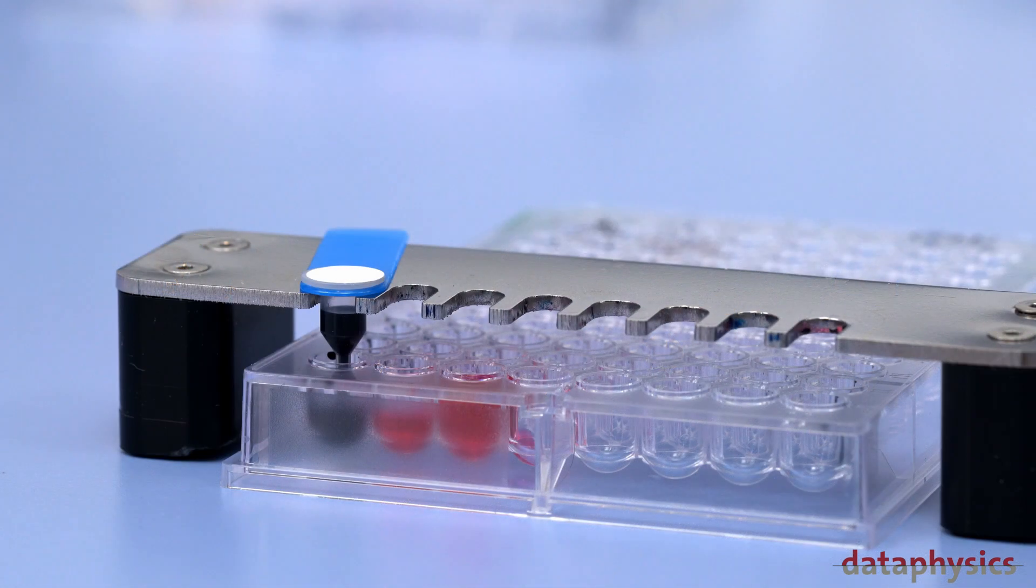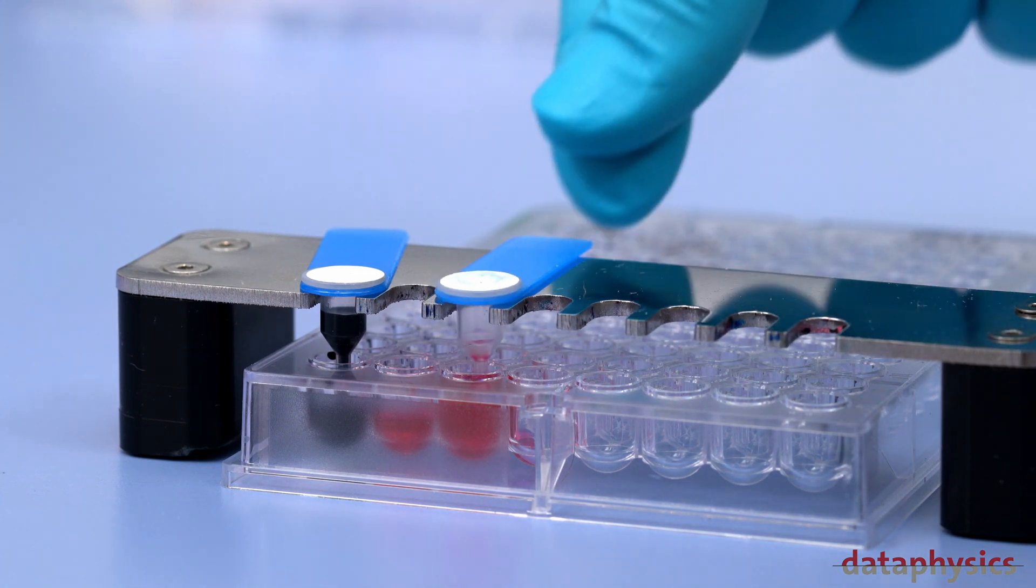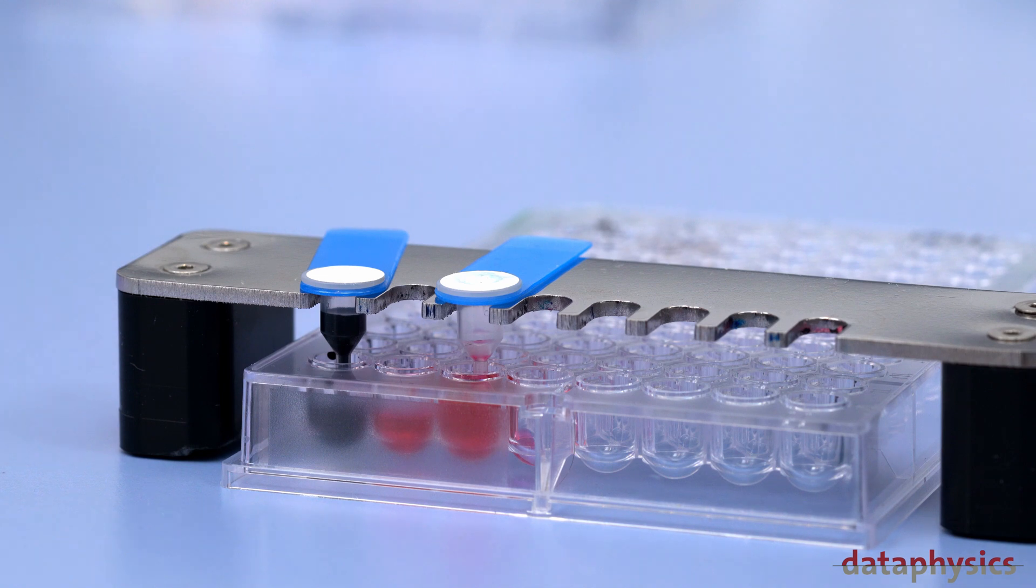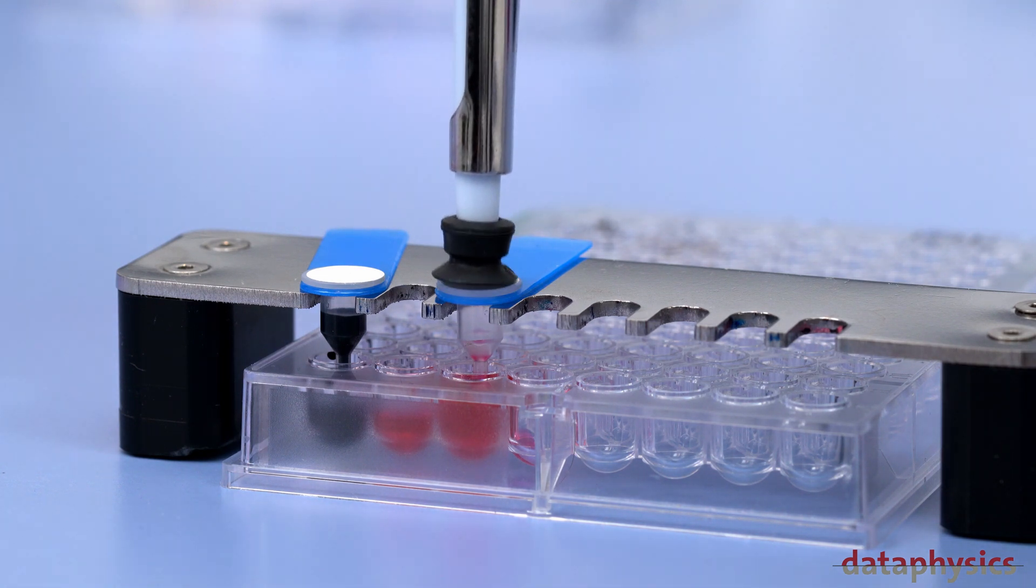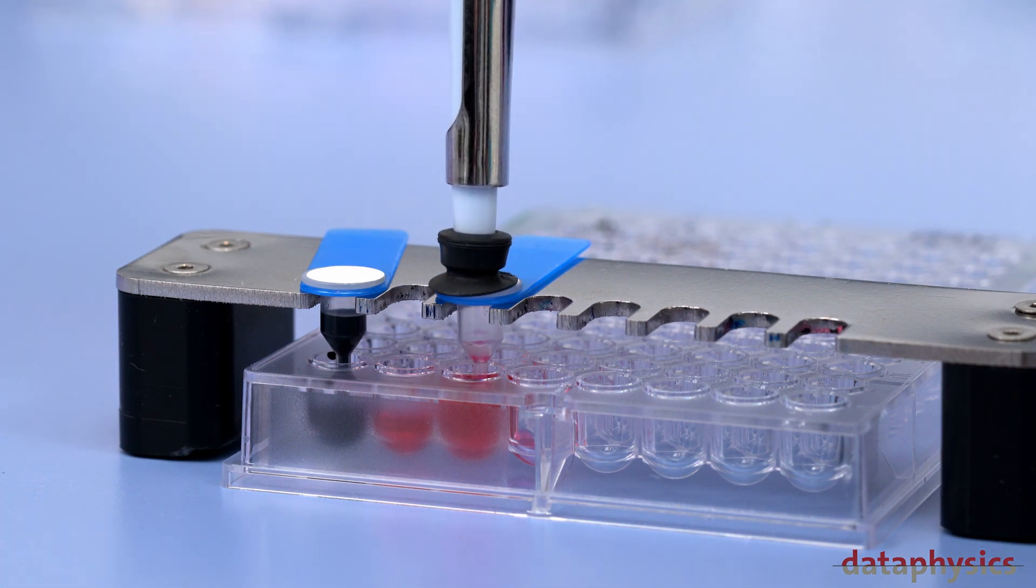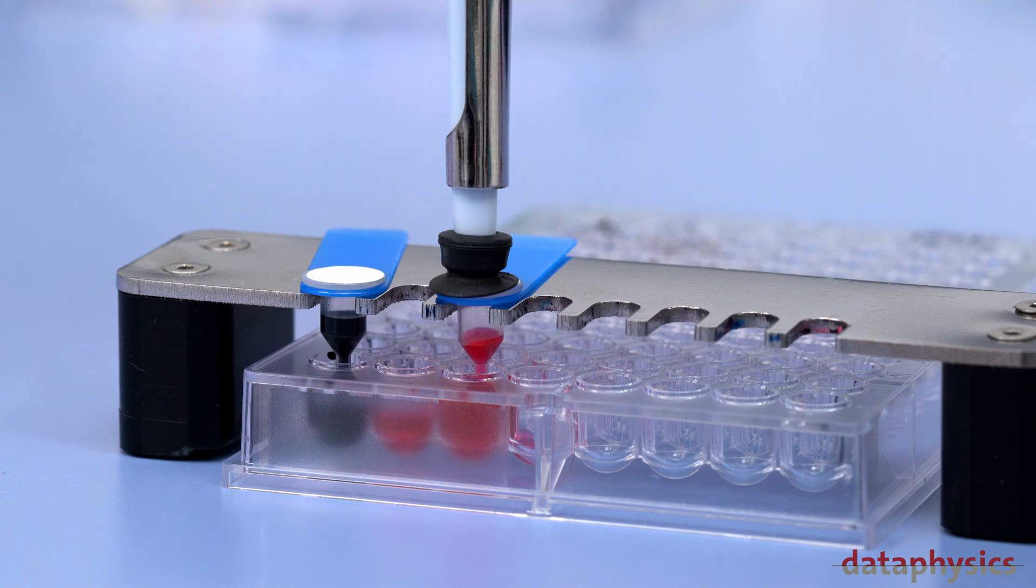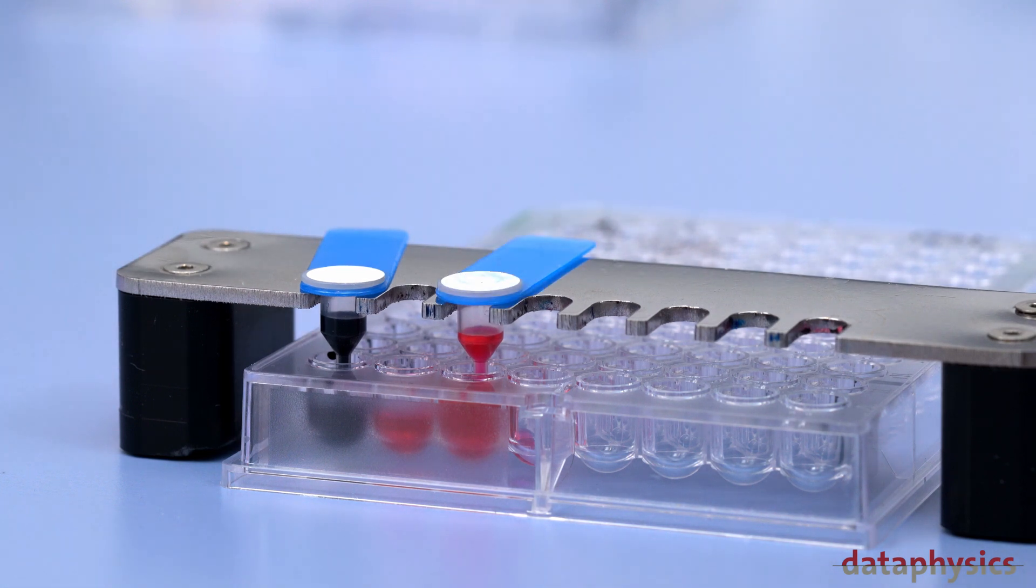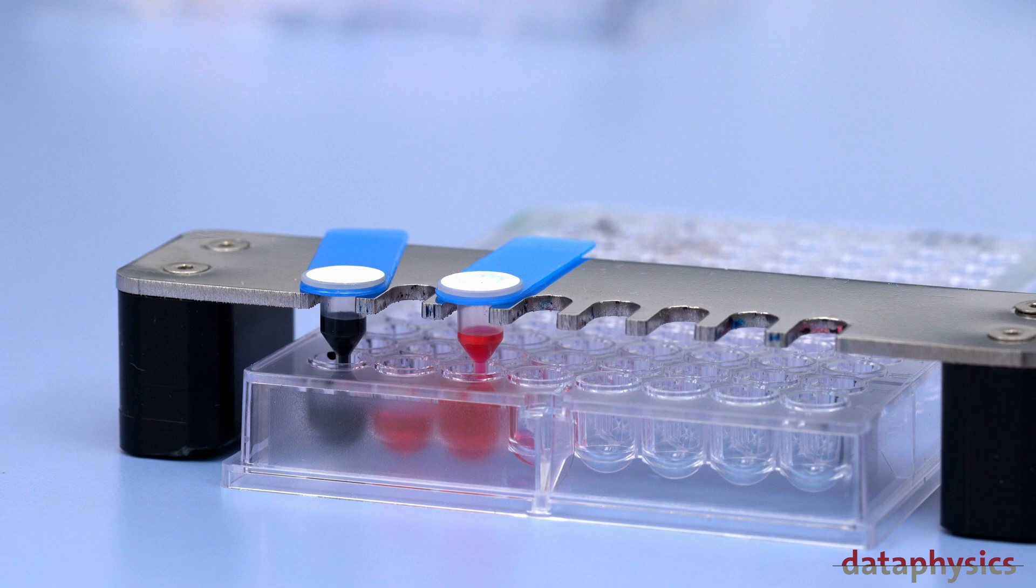The tubing-free dosing system uses disposable cartridges that are easily filled via aspiration using a standard pipette with an adapter. The disposable cartridges prevent any risk of cross-contamination and time-consuming cleaning efforts become unnecessary. This means that pure liquids, suspensions, emulsions, and other challenging liquids like inks or surfactant solutions can be investigated without any trouble.